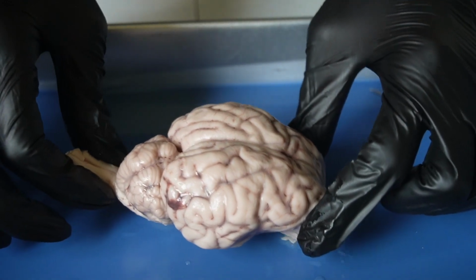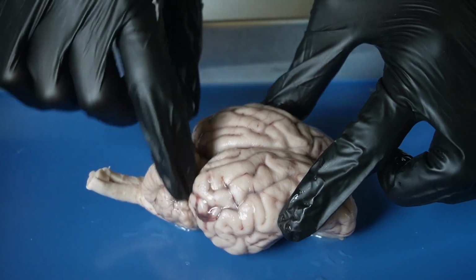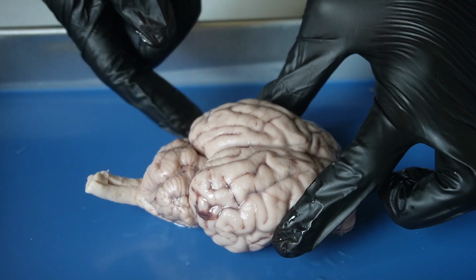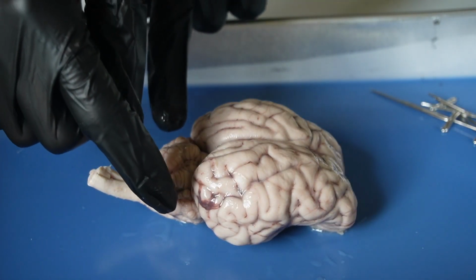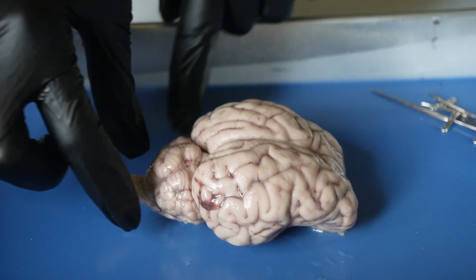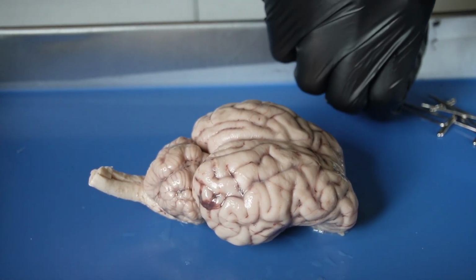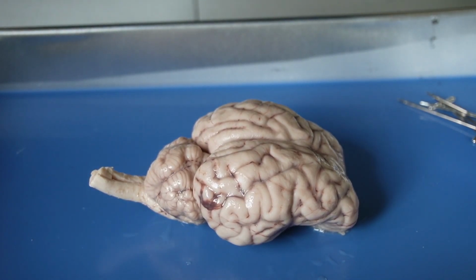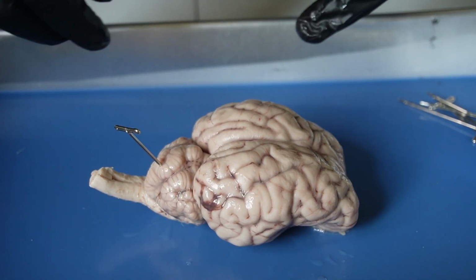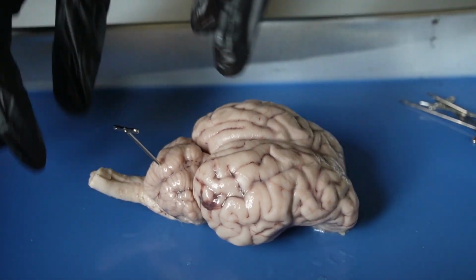Next would be the cerebellum, which is this part here, and the cerebellum is underneath the cerebral cortex. The cerebellum monitors and regulates. Let me see if I can put a pin in it. Okay, so it regulates movement as well as posture.